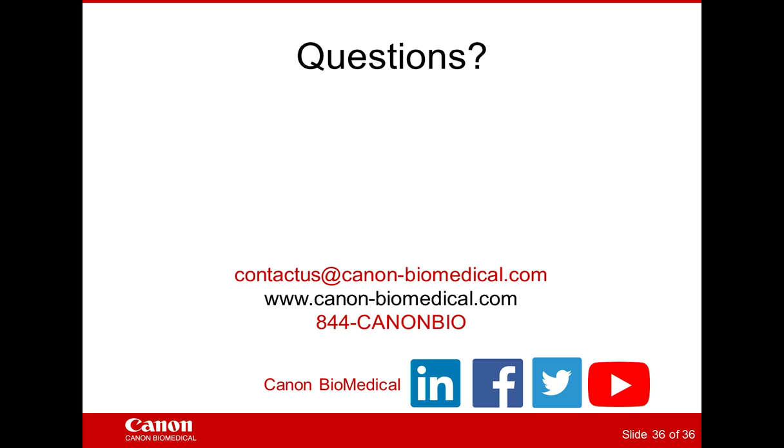Great. And we have time for one more question, and this one feeds off of that. It says, do you offer this as a service? We actually get this question a lot at trade shows and when we're out at customer sites. We don't offer this as a service. The thought here was to put together a genotyping method that researchers who want to bring this into their own lab, or have it done more quickly than a send-out service, would have access to do so.